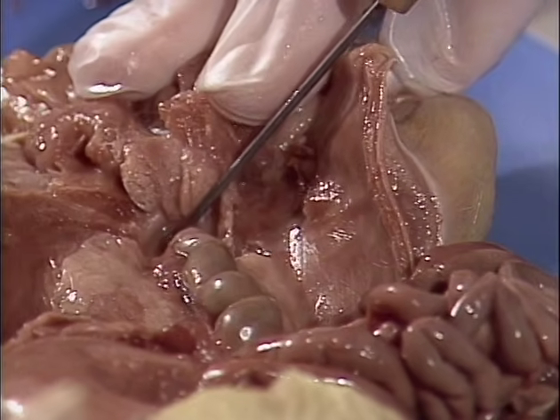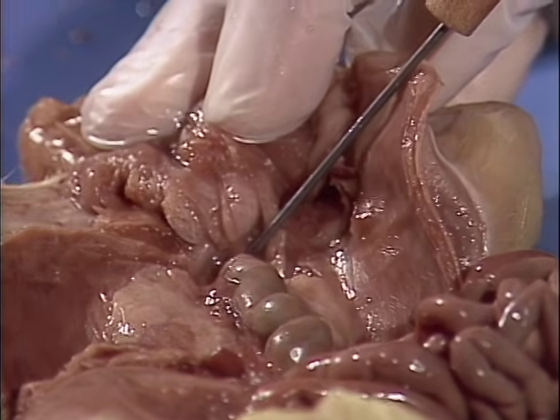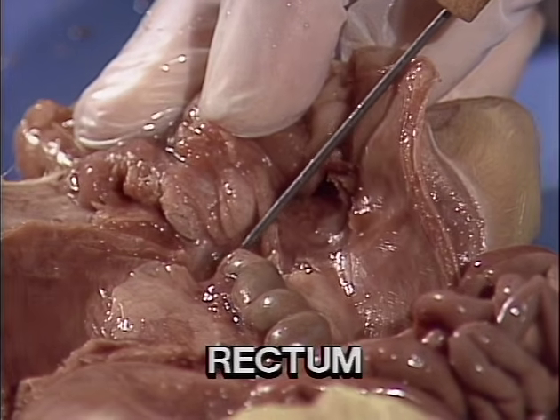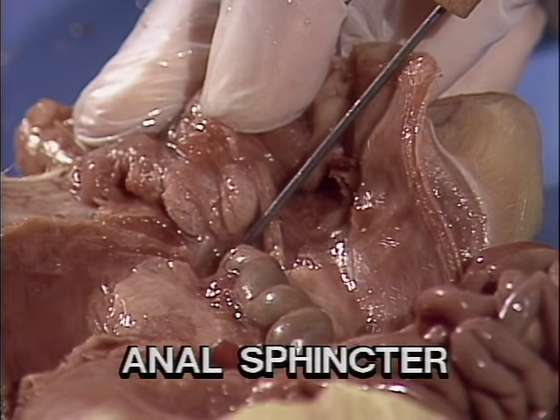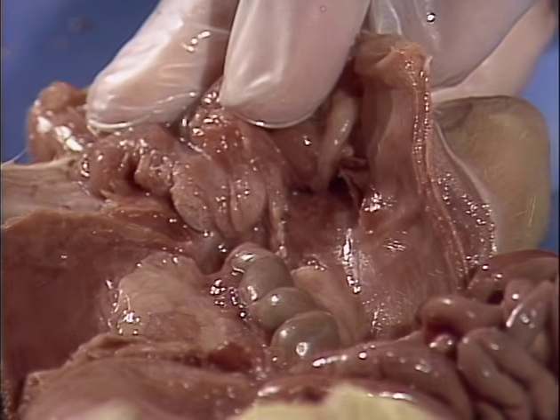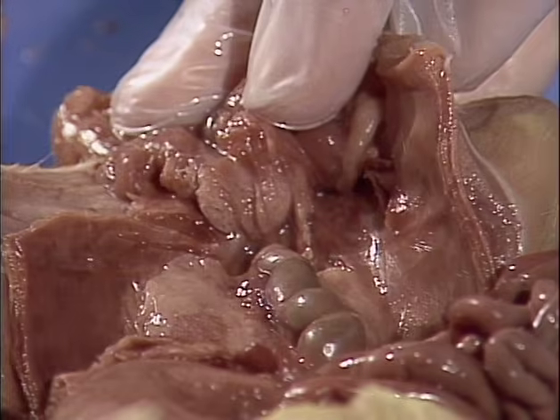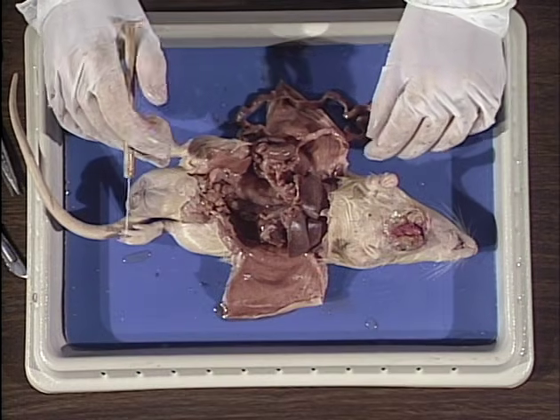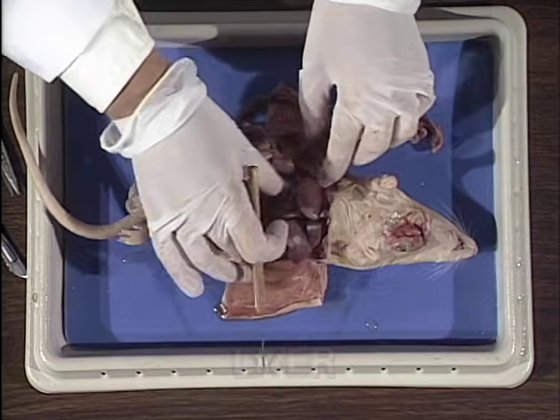The descending colon enlarges caudally to form the rectum. The anal sphincter muscle controls the movement of feces from the rectum to the outside via the anus. There are several other structures associated with the digestive system through which food does not pass. One of these is the liver.